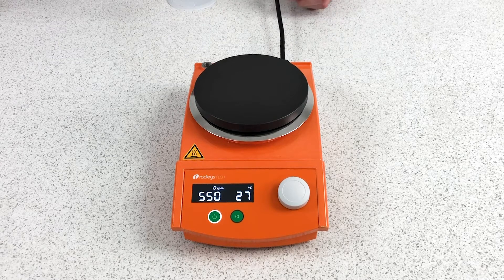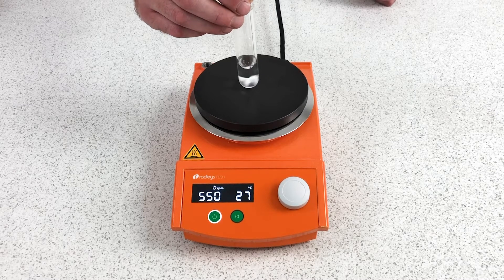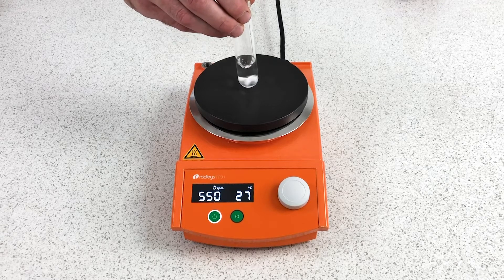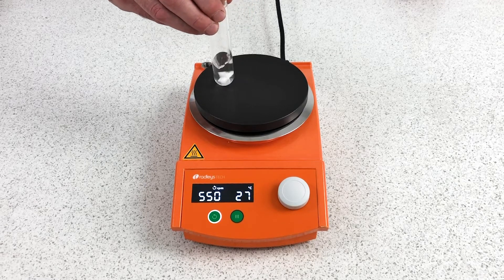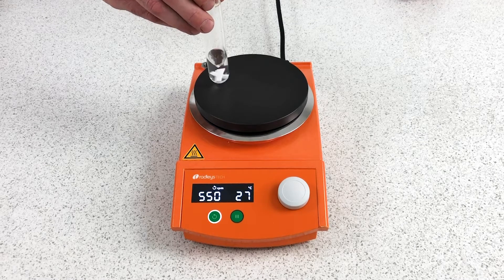To start, let me show you the carousel principle. Normally, if you set a reaction up on a hot plate in a flask, you set the flask in the center of the hot plate to get optimal magnetic stirring. As you move out from the center, the stirring becomes uneven and irregular.